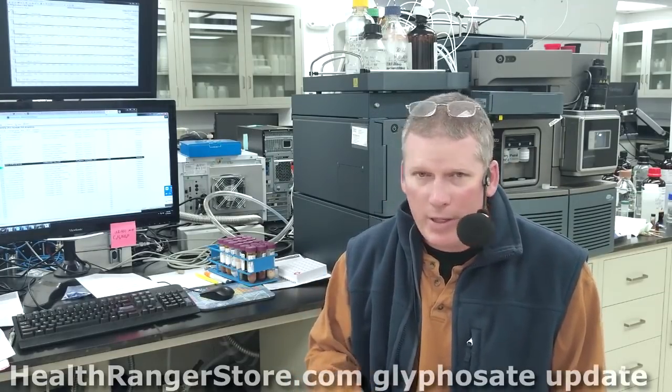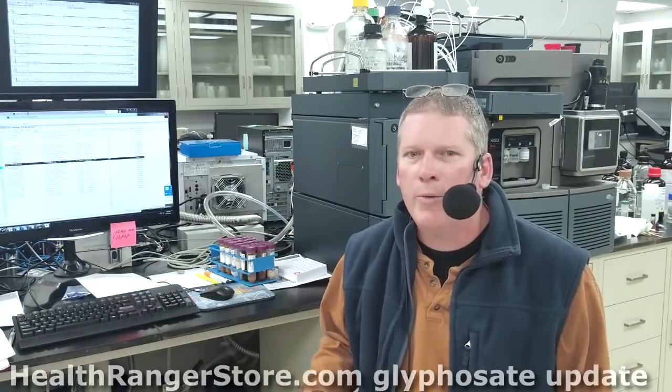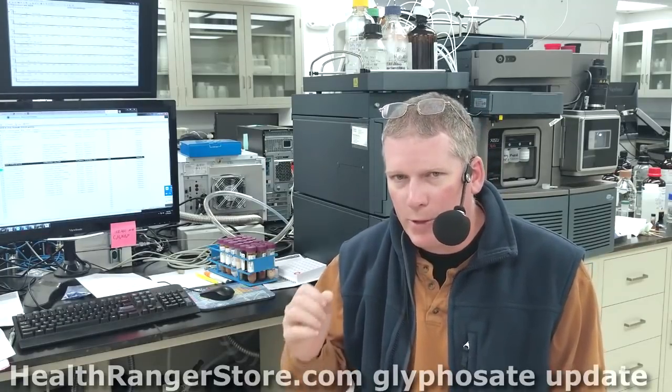That's in a completely different location than this lab. We don't do microbiology in this building because I don't like being around E. coli and salmonella and all that stuff. So we do that in a different building. It's still part of our company, just in a different location. This building is dedicated to mass spectrometry.